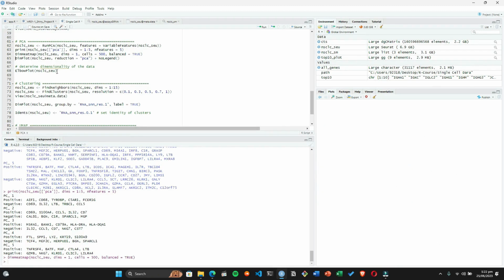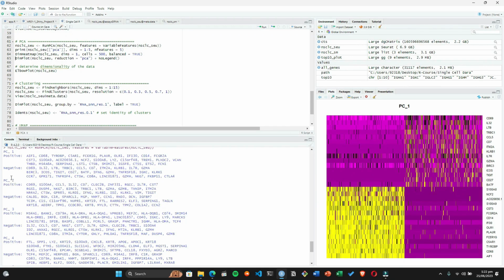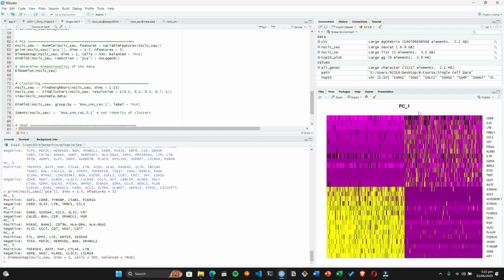So now that scaling has been done, we move on to viewing our single cell scRNA object, and here we can see we got the counts data, assay data, meta features, and things like that. Now we move on to the PC analysis.